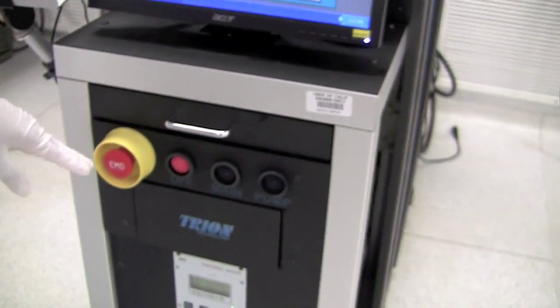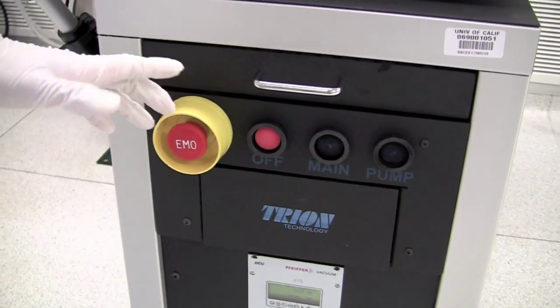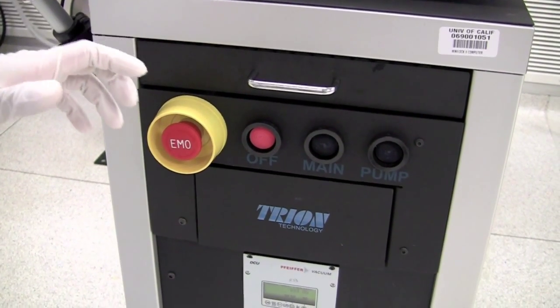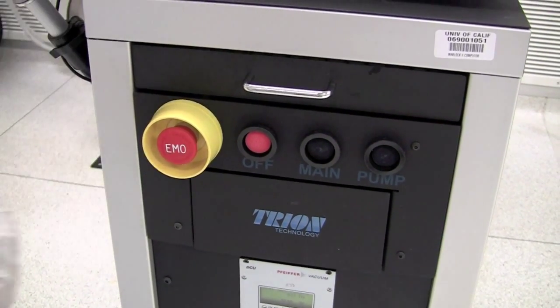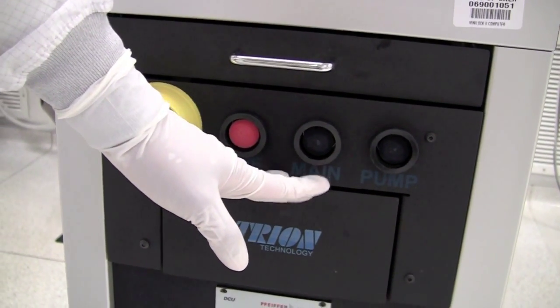Right above it, we have a couple of emergency controls. We have the EMO, which is an emergency shutoff. If you hit this, the tool will shut off. So in the case of a big emergency, a fire or an earthquake, and you have to shut off the tool, hit the button. We also have a red off button and a couple of other tools here that are not really used or intended for regular users.